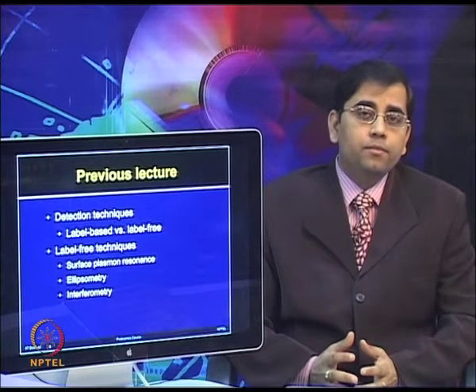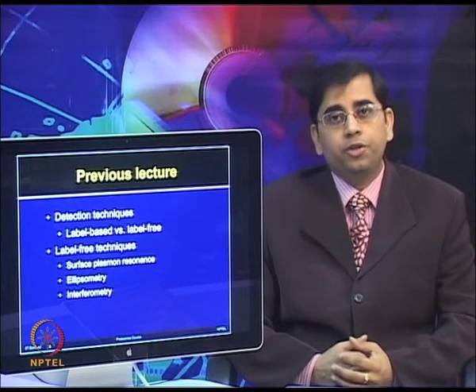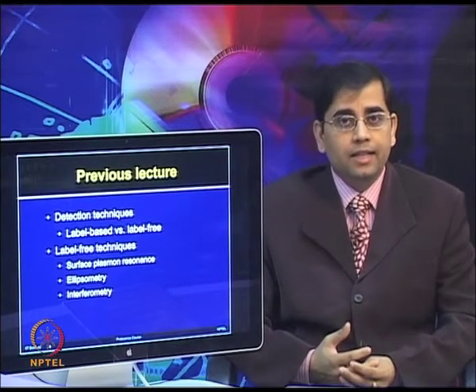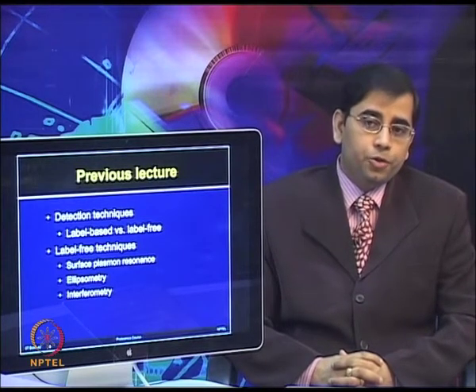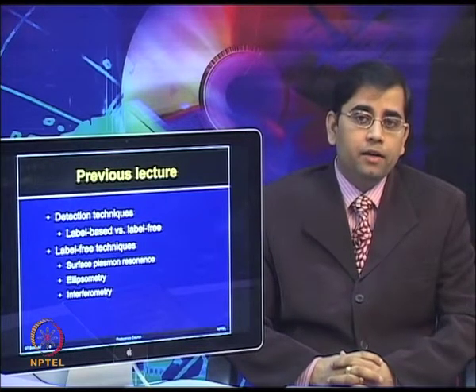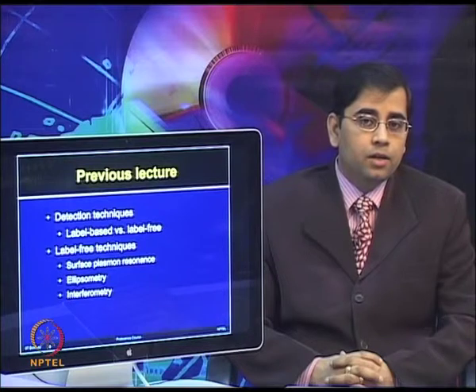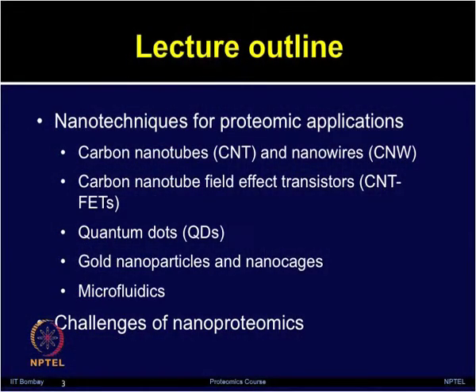The successful integration of nanotechnologies with proteomics has now introduced a new field in this clinical research area known as nanoproteomics. This is one of the very rapidly emerging areas for biomedical research, which may ultimately have tremendous therapeutic potential. So, in today's lecture, we will talk about different nanotechniques which are applied for proteomics applications.